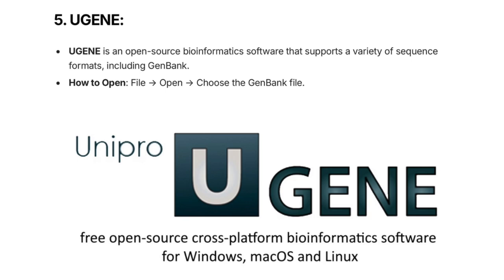Another tool to check out is Unipro UGENE. This is a free, open-source, cross-platform bioinformatics software that can be used on Windows, Mac OS, and Linux. UGENE supports a variety of sequence formats including GenBank, and once you have it open you can go to File > Open and choose the GenBank file.